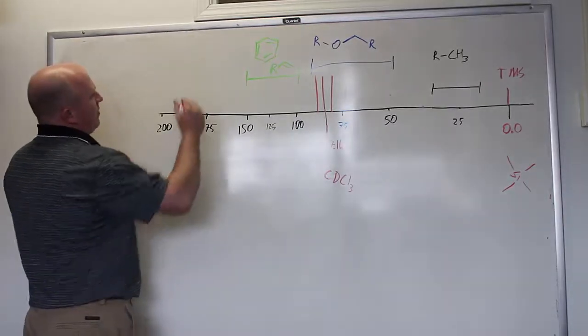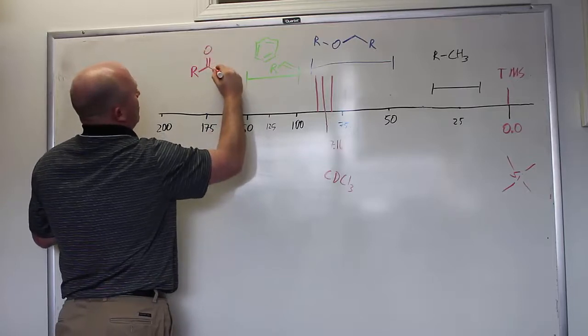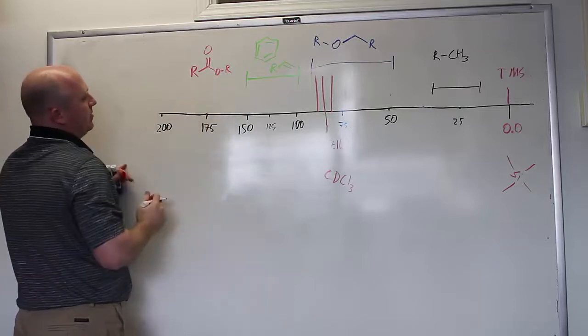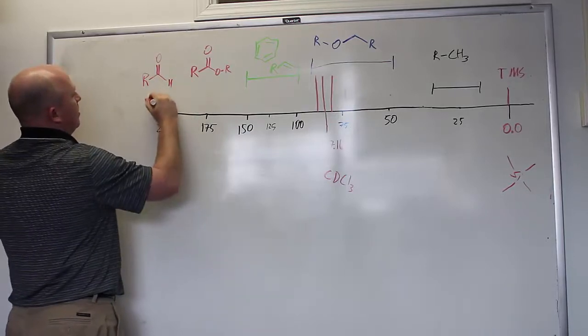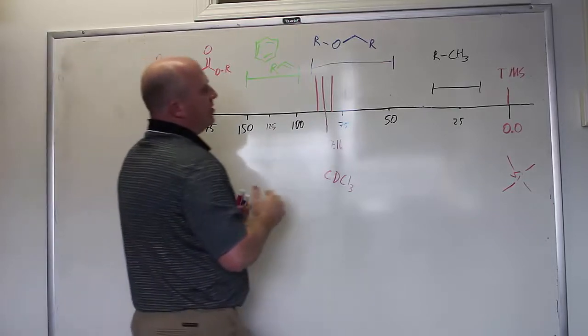Right around 175, you see interesting carbonyl behavior. Specifically, it'll be a carbonyl that has an oxygen also bound, so carboxylic acids and esters show up at 175. Ketones or aldehydes are also going to show up in the carbonyl range, but they will show up closer to 200. Broadly speaking, there are 4 regions of interest.